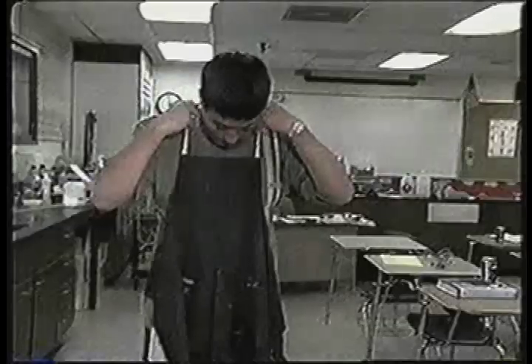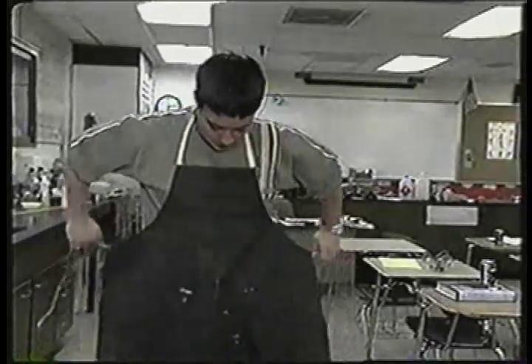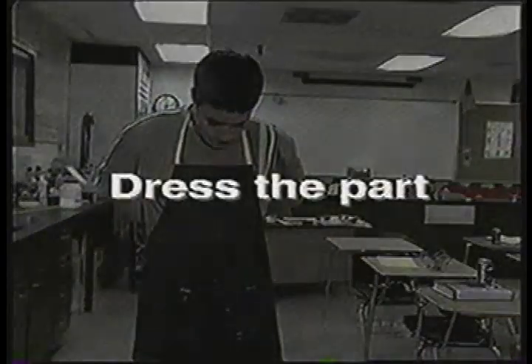But the most important thing to remember is to stay alert and have a positive attitude. It's just as important as any lab equipment you'll ever use. And knowing what's going on around you can help keep you and your other students out of serious danger or trouble, whichever comes first. Different labs and different experiments require different equipment and different approaches.